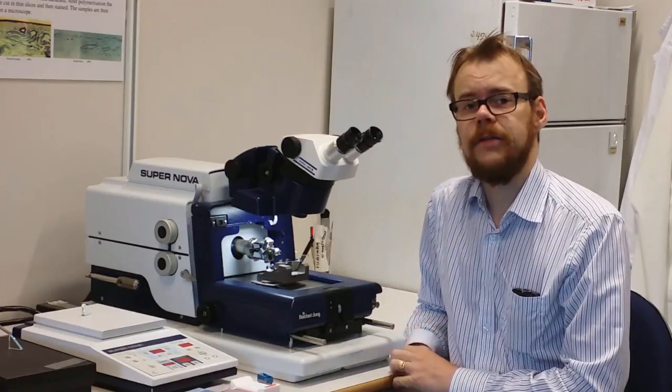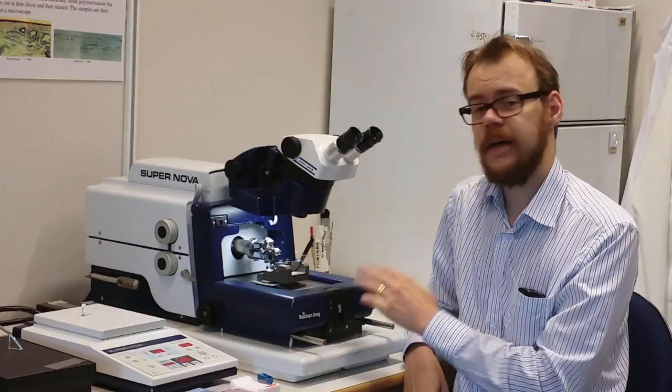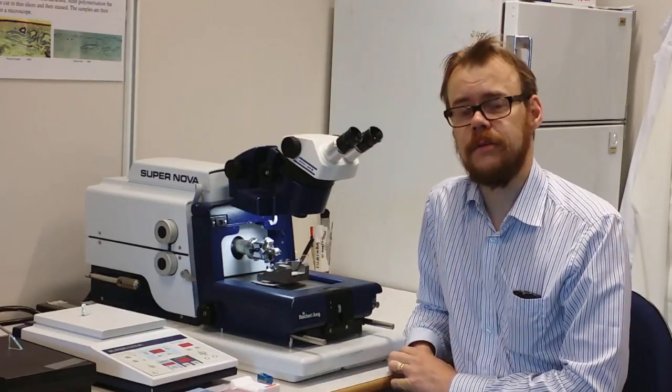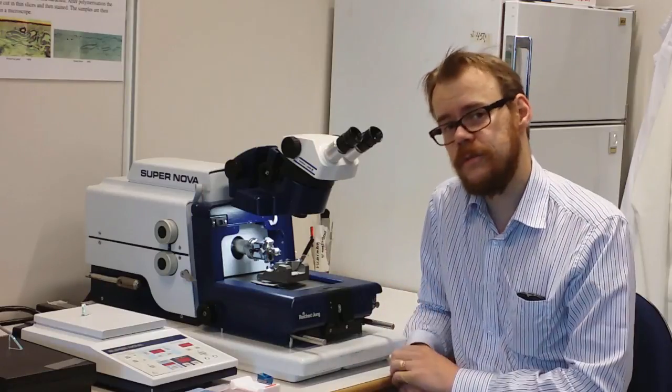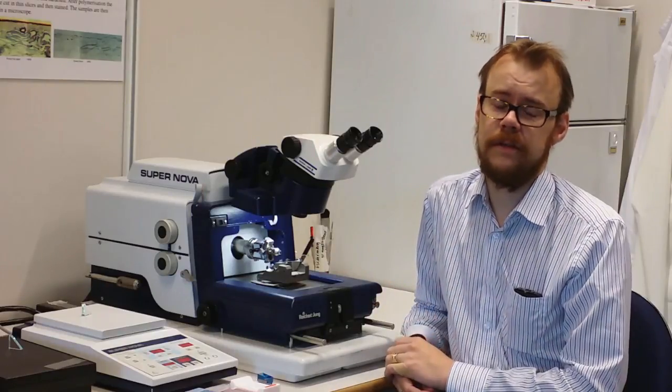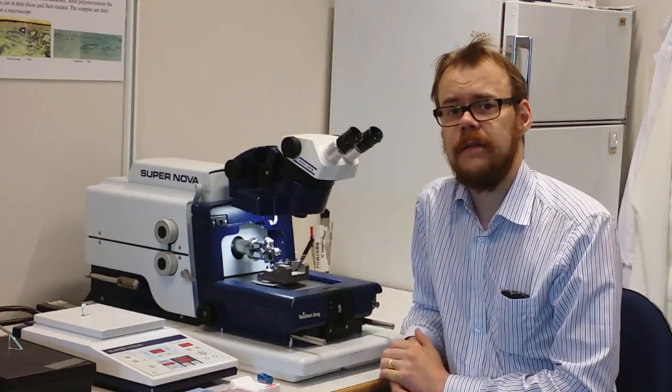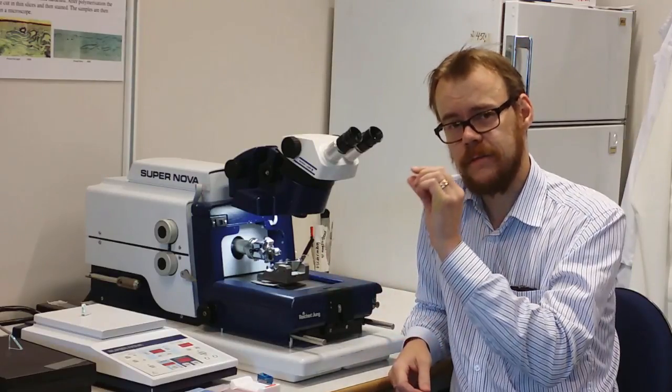Hi, this is an ultra microtome machine. This machine can cut very thin slices of the sample that you're going to do transmission electron microscopy on. You can also use it for light microscopy, but then you use thicker samples. This machine can go down to 50 nanometer in slices, the thickness of the sample that is.